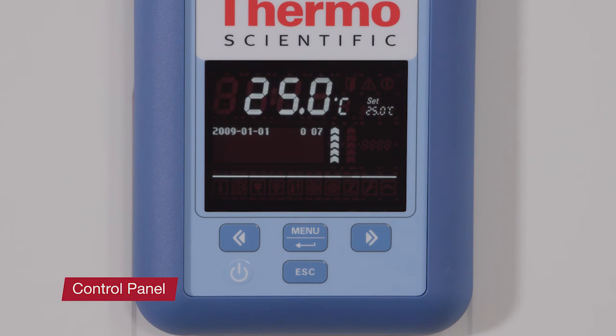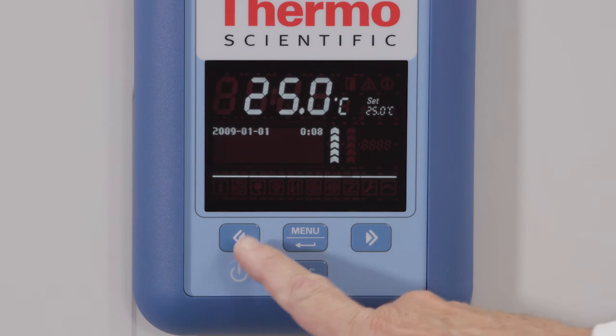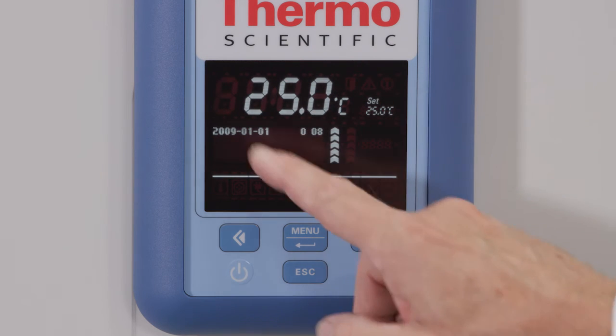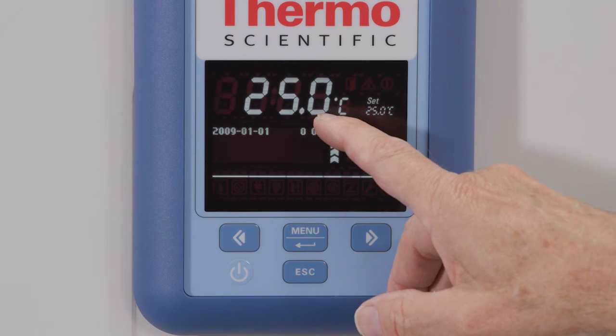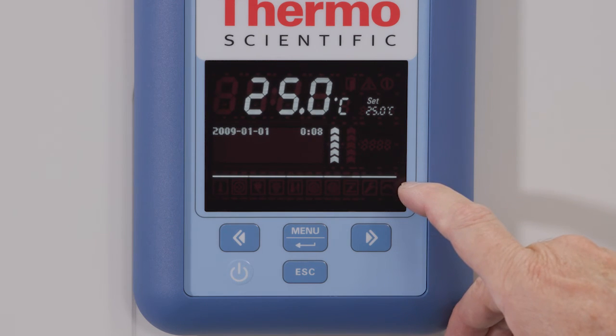Next, let's take a look at the control panel. On the panel, you will see the on/off button, the menu button, two toggle buttons, and an escape button. A detailed explanation of the button functionality can be found in the user manual. The display field will show a permanent readout of the actual temperature in the unit, with one digit after the decimal point.